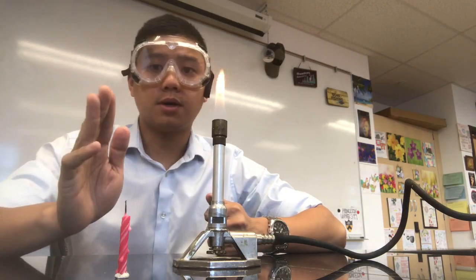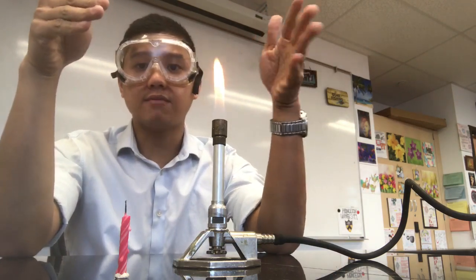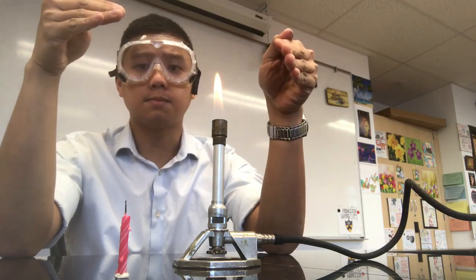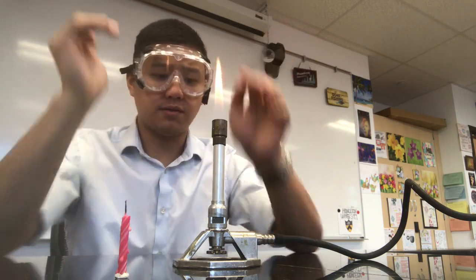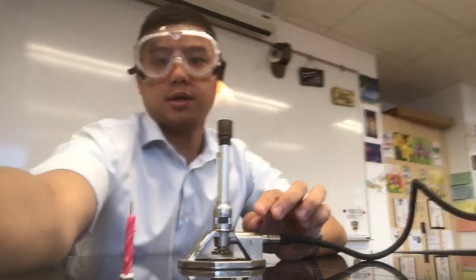The next thing you want to do about your Bunsen burner is, you see this orange flame? That means that the flame does not have enough oxygen. I want the flame to be blue, because the blue flame has more oxygen, and it's actually going to be able to heat up faster. And so the way I do that is, there's this air control knob right here, okay?